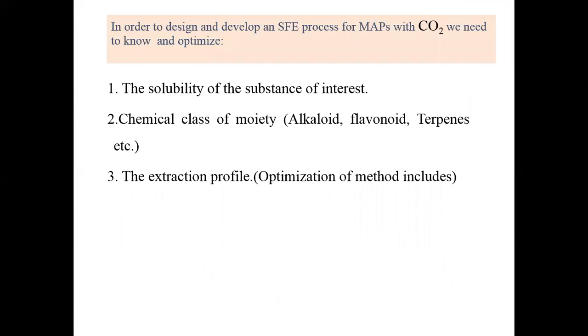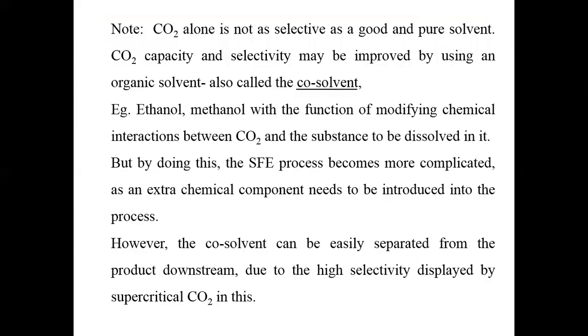In order to design and develop a supercritical fluid extraction process for medicinally active products with CO2, we need to know and optimize the solubility of the substance of interest, the chemical class of the moiety, and the extraction profile. A very important note is mentioned here. During the process, to improve the properties of supercritical fluid CO2, various co-solvents and modifiers are added. CO2 alone is not as selective as a good and pure solvent.